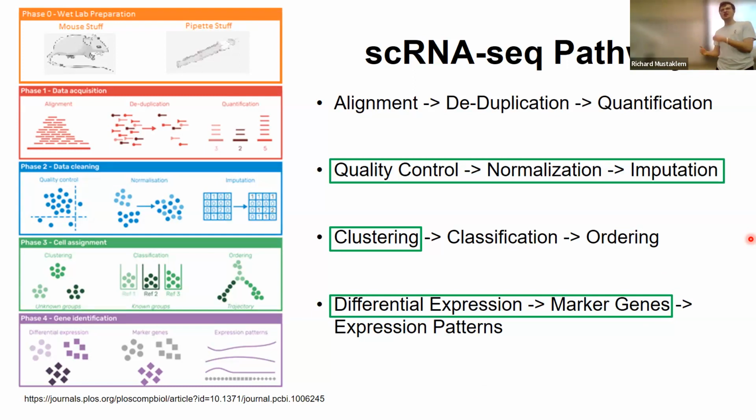Again, it's all automated. You are just moving it from machine to machine. Eventually, you'll end up with a bunch of cells that are isolated with beads on them that are identifiable by the 10x machine. And then that will make a database for you. It has many different names, but Seurat calls it a Seurat object. That's the pipeline. They identify it as a Seurat object. It's literally just a database that has the gene.